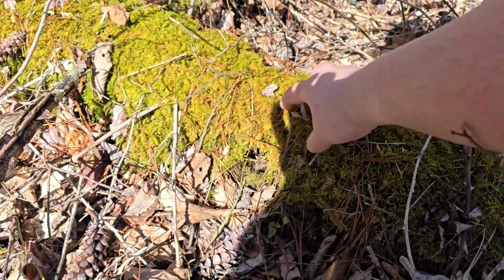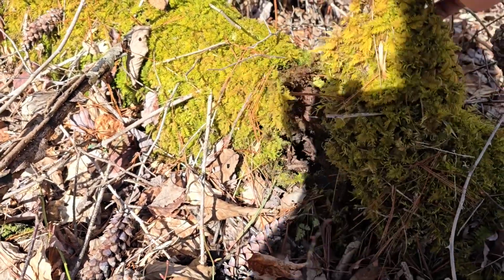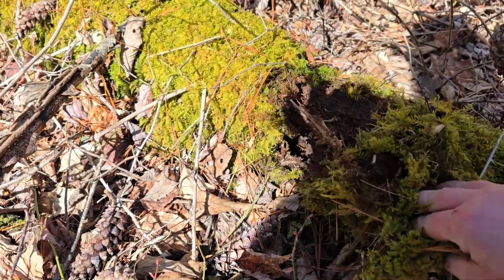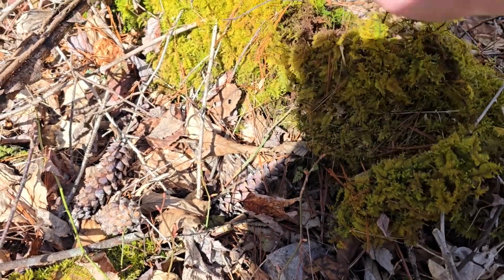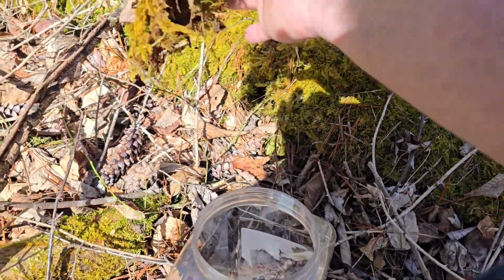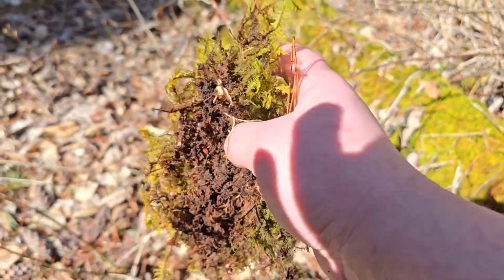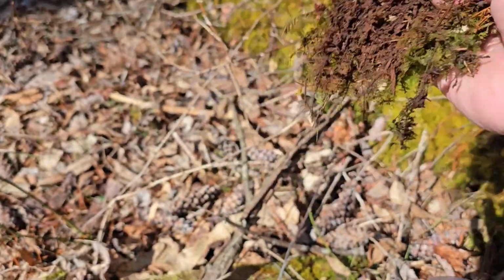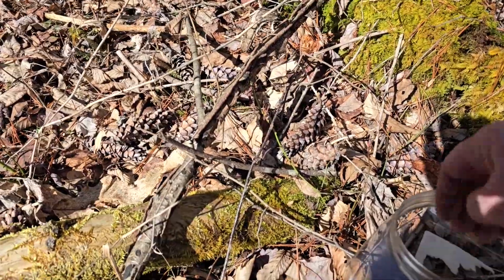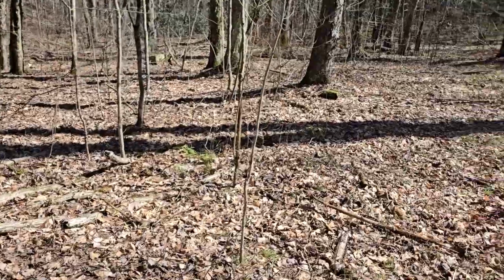Let me open up this container. And I want to get some moss all the way deep down in here. I don't need a whole lot. But I do want to get the moss, like the part that's not exposed to the air. I want to get the underside of it too. I don't want to just take little chunks of it. See how this bunch of moss that I took off has all of the decomposed matter and stuff on the underside there. I want that because that's going to house a lot of interesting little critters. So there's one. And let's see.